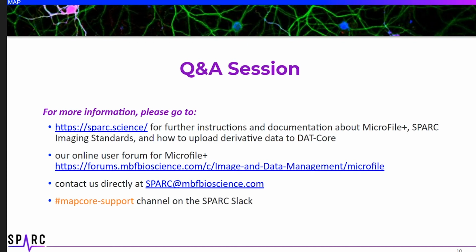Yeah, that's definitely how I do it, especially for SPARC data sets, which can have a variety of image types within one single data set. And so I will often need to set up those experimental presets for a few different cases for one data set. Yeah.